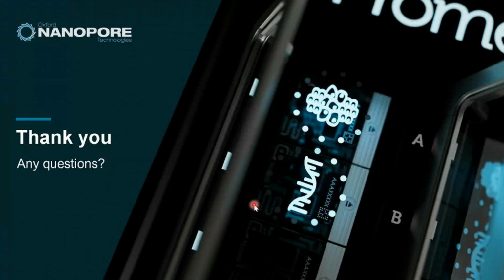Okay, we have another question. For the metagenomics analysis for fermented foods, are there any specific kits or protocols that you recommend? Would it be the same as for environmental samples?